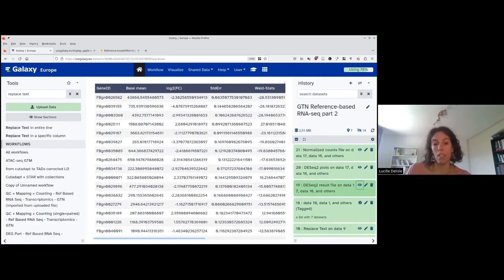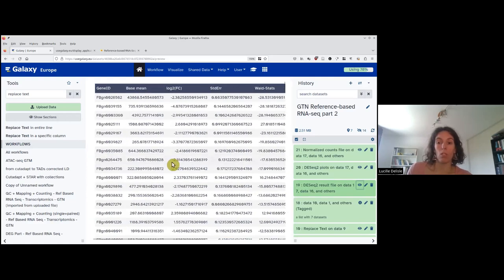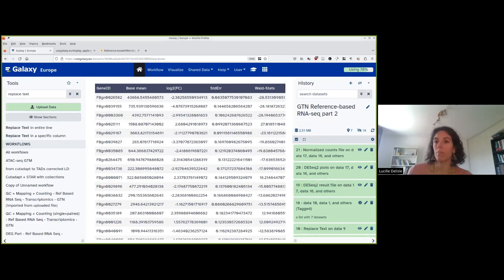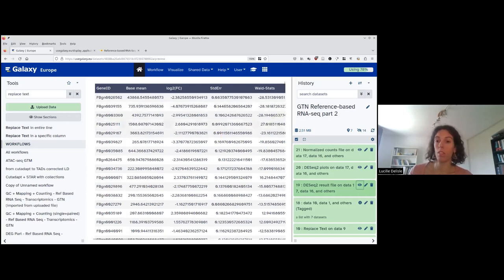Once we have these results, I go down into the tutorial. We would like to annotate the results because everything in the DESeq2 result file is labeled with a gene ID, but usually we are more familiar with gene names. This gene name does not appear in the table, so we will be able to add it using the GTF file.